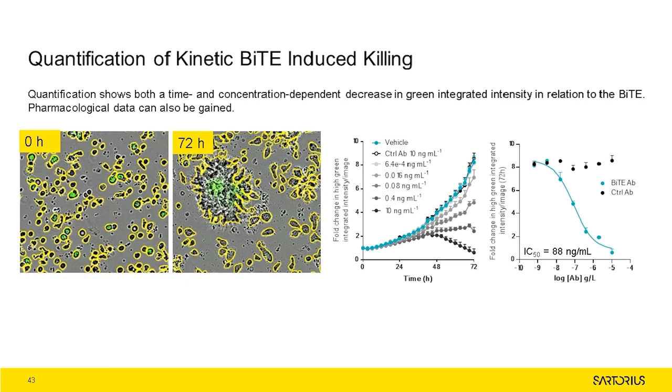This data can then be used to achieve pharmacological readouts, and we see here that only the BiTE induced death, and the control antibody used here, which was a CD3 beta-galactosidase BiTE, did not induce such a response.